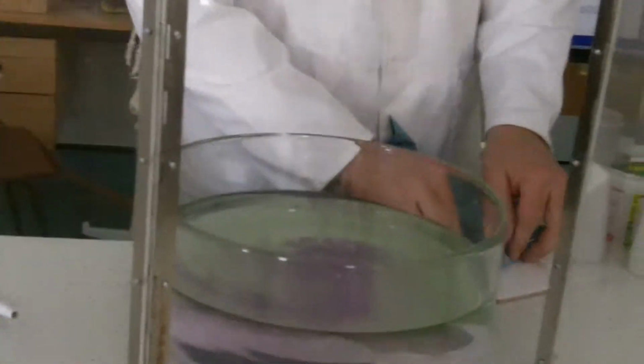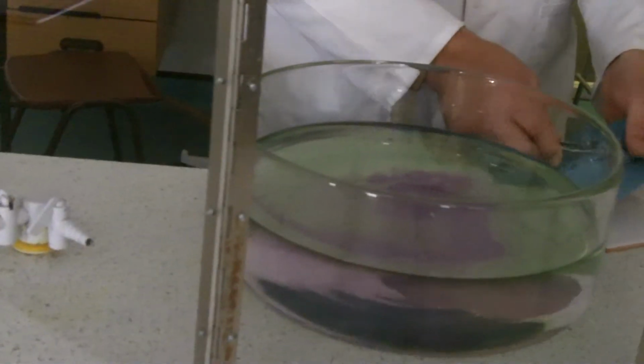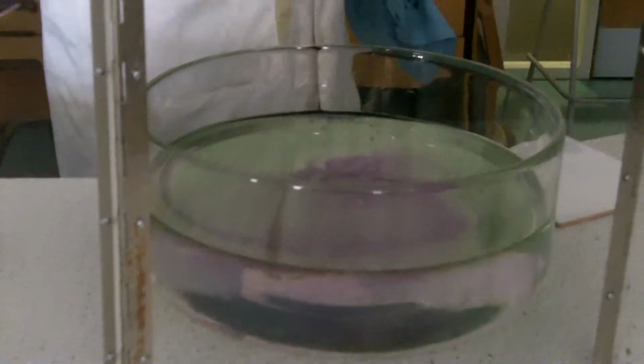Do you think this is going to be more or less reactive? More, because it's lower down in the group. You know me too well, don't you? You know I don't start with the most reactive. I build up to it. Is potassium the most reactive? We'll find out. Okay, here's sodium. This is sodium in water.